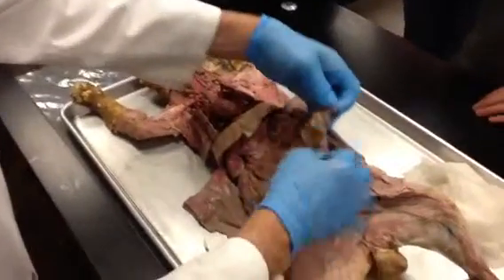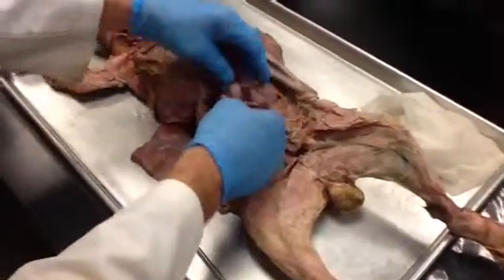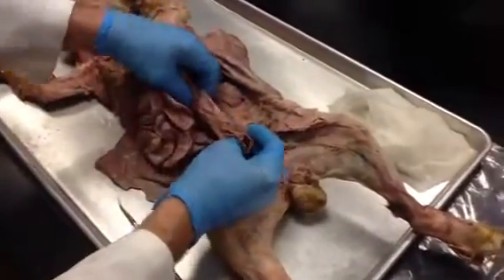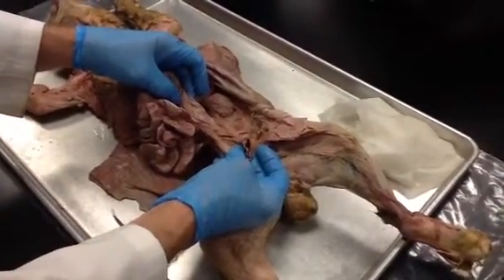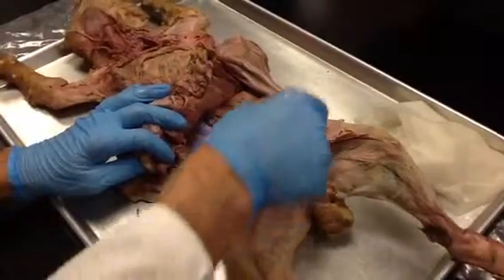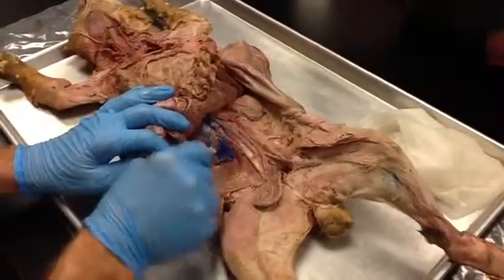So if we remove, or at least shift, we can actually move the omentum. Most of this is actually small intestine. In the cat, the large intestine is very short, only from about here to here, as opposed to about 5 feet in length in the human. But if we move this all back out of the way, just for reference, this is the urinary bladder. This vessel right here is the ureter that carried urine from this kidney to the bladder.